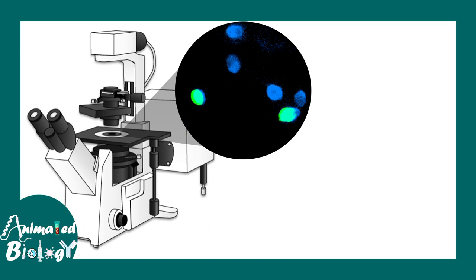Now, the cells have to be visualized under the microscope and co-labeled with the nucleus marker DAPI. Here, blue is DAPI and green is the TUNEL staining. It's basically a 488 nanometer wavelength labeling. Anything which is green should be indicative of TUNEL positivity. So this is a TUNEL positive cell. This is a TUNEL negative cell. TUNEL negative cells are healthy. TUNEL positive cells are inferred as apoptotic cells.